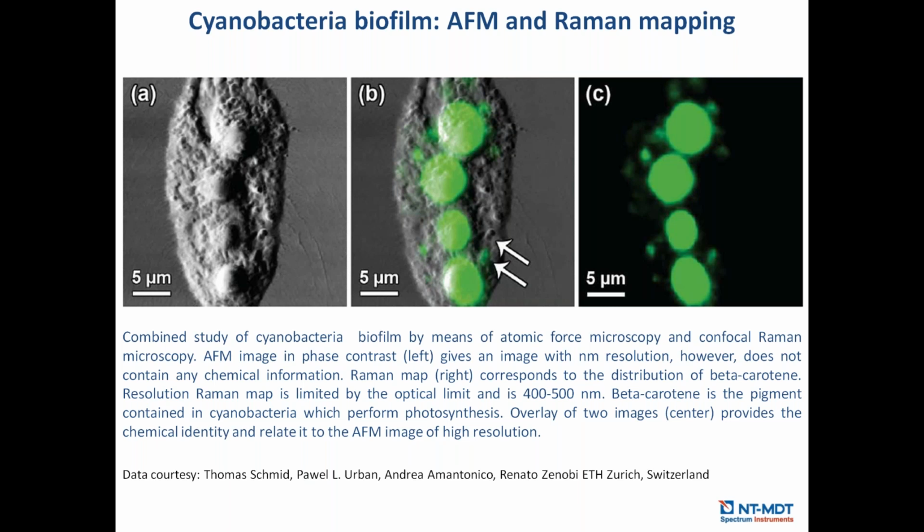Okay, thank you. So the next question, how would you comment on the stability of TERS probes? How long do they live in the air? How long does the tip last? What is your experience? Yes, we have experience with such probes. I personally have experience with gold and silver etched probes. For example, we found that over weeks they can work more or less okay.